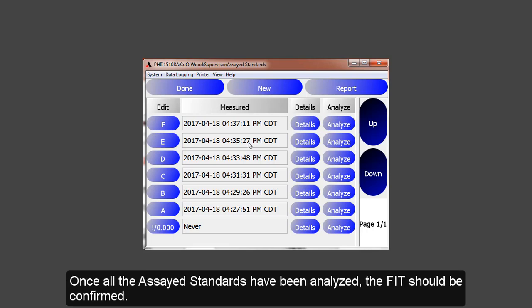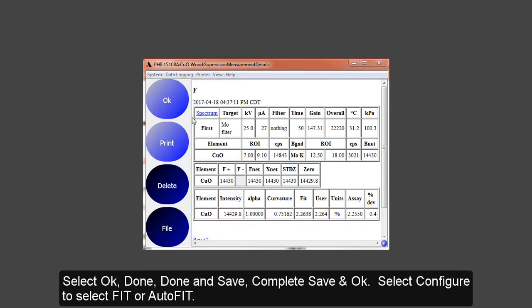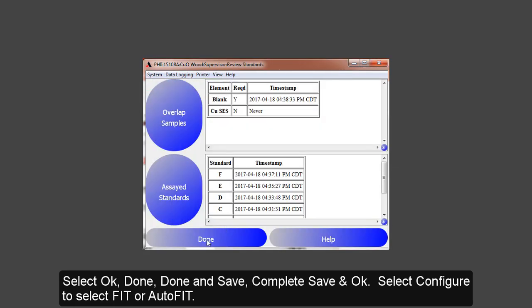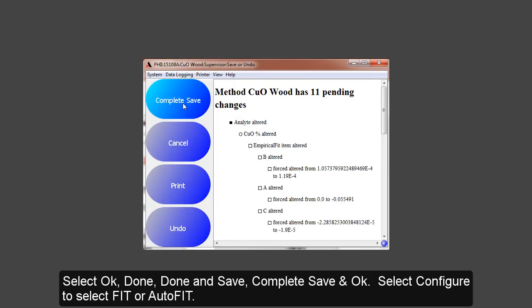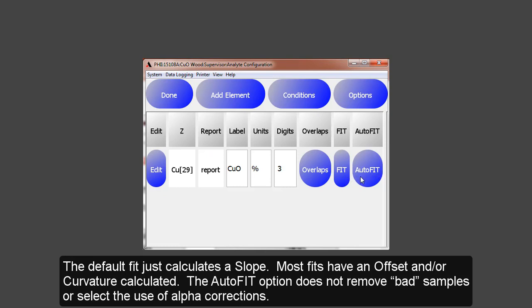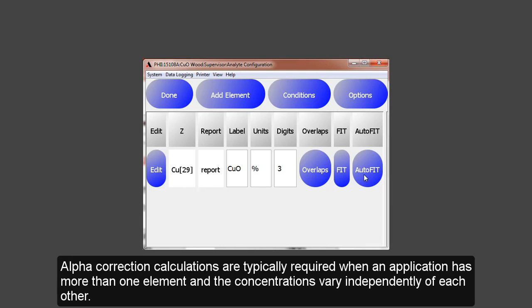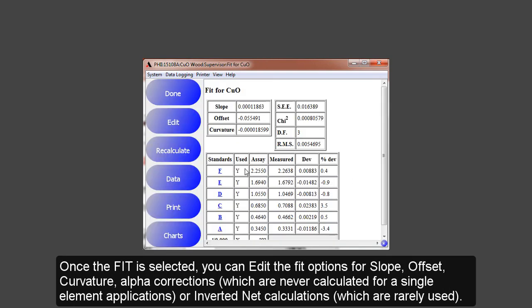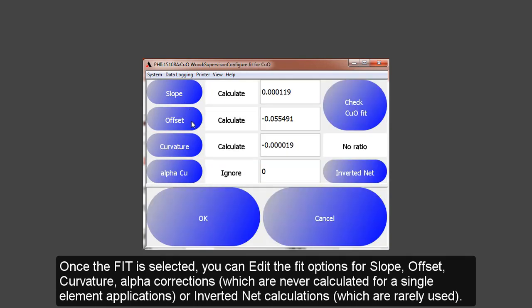Once all the assayed standards have been analyzed, the fit should be confirmed. To get to the fit, you'll select OK, Done, Done. You'll want to save any changes and select Configure. Fit or AutoFit will work to pick your fits. AutoFit will pick the best fit with slope, offset and curvature. However, it does not remove any bad samples or select the use of alpha corrections. Alpha calculations are typically required when an application has more than one element and the concentrations vary independently of each other. Once the fit is collected, you can edit the fit options for slope, offset, curvature, alpha corrections or inverted net.